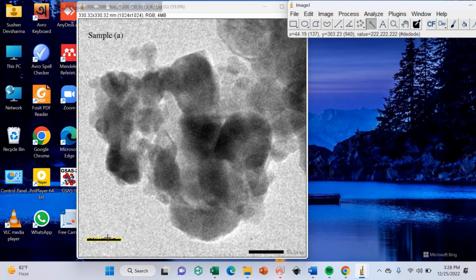You can see here, change the location and add the text button. In the same way you can add text 50.